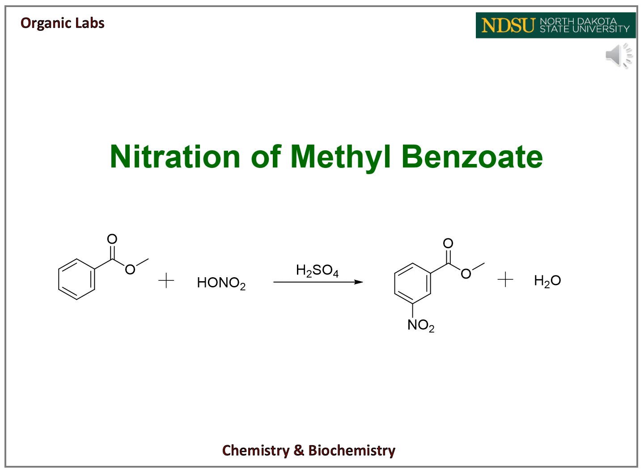Hello everybody. Today I'll be talking to you about the reaction that you'll be doing in lab this week, which is the nitration of methyl benzoate. You can see the reaction scheme here, reacting methyl benzoate with nitric acid and sulfuric acid to get your product.